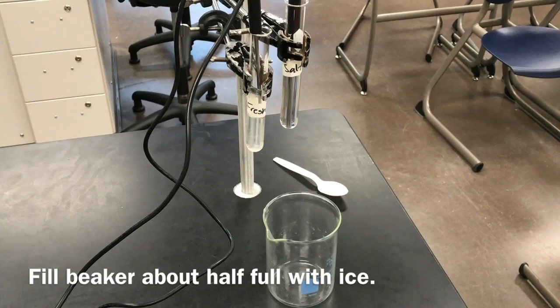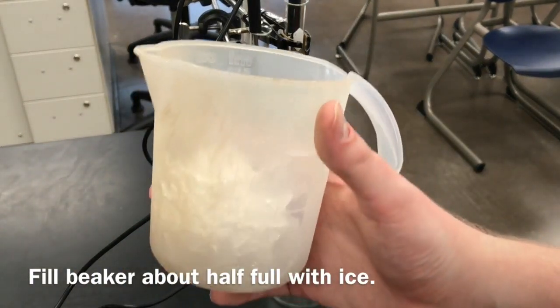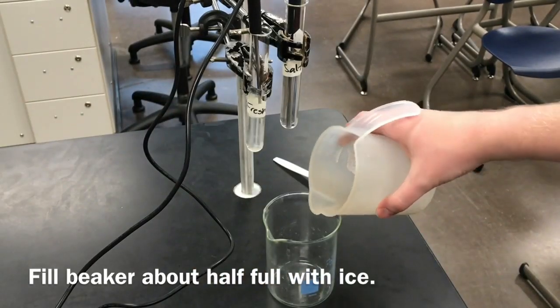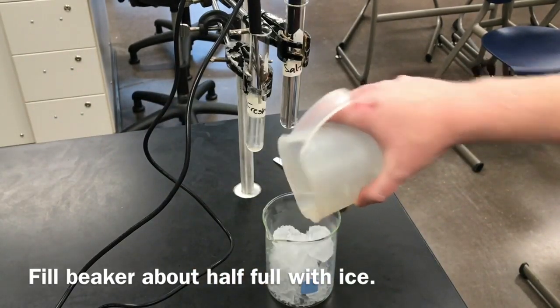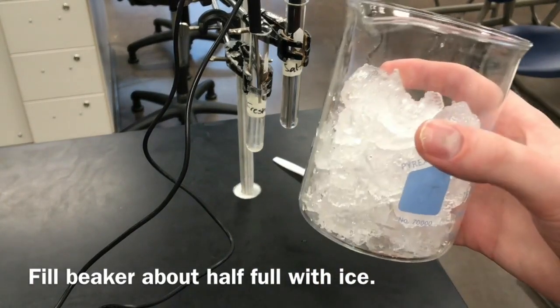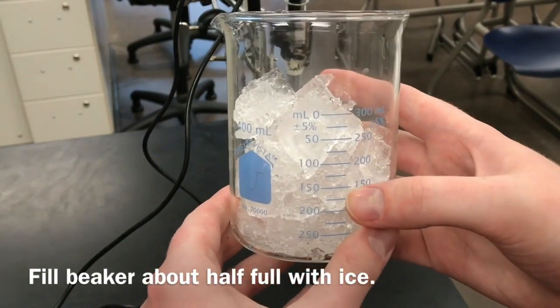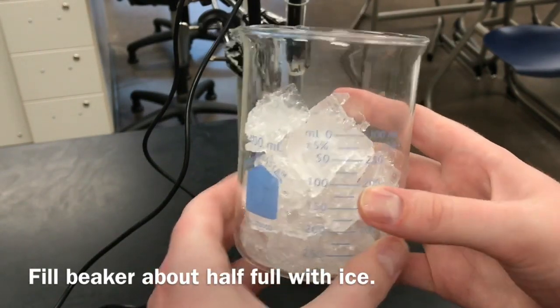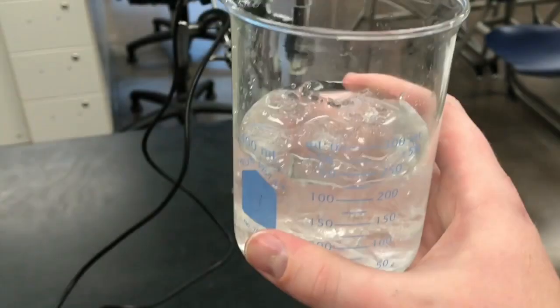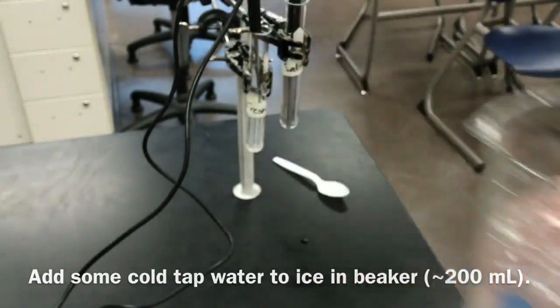The last thing I'm going to do for my initial setup, I grabbed about half a scoop of ice. I'm going to dump this into my 400 milliliter beaker. You don't want it to be too full. I got it about half full. Then I'm going to fill it up with a little bit of water too, maybe between 150 and 200 milliliters of cold tap water. I've got a nice ice bath. Again, you want to fill it maybe about half full. You don't want to get this too full.